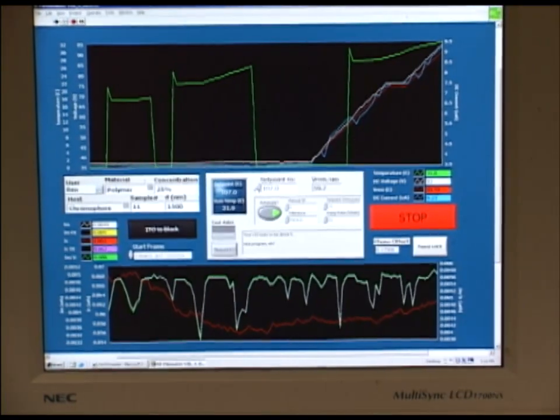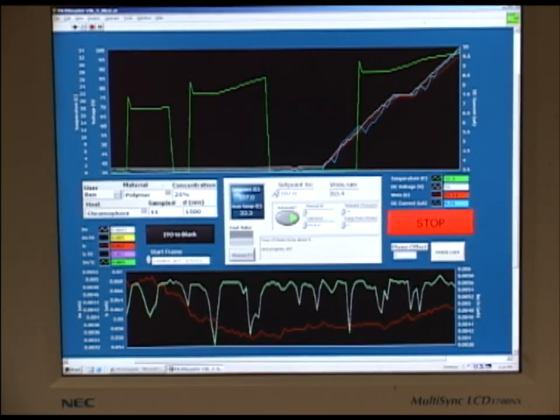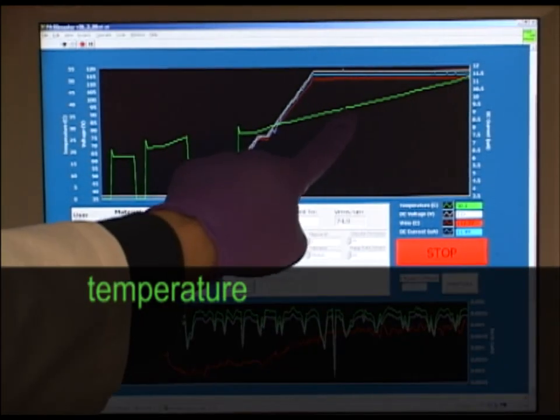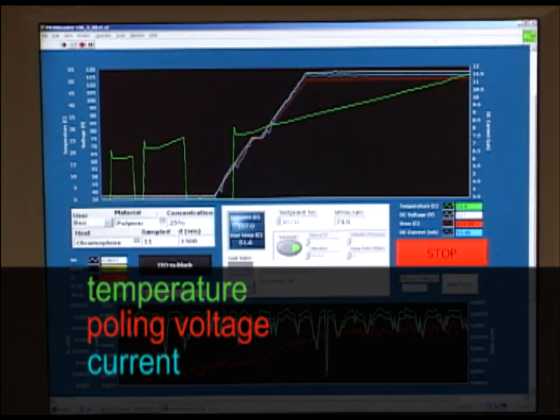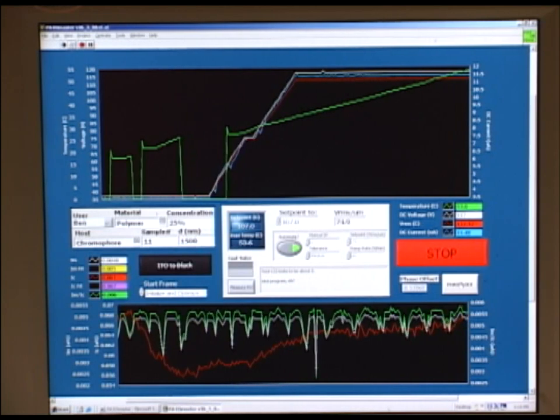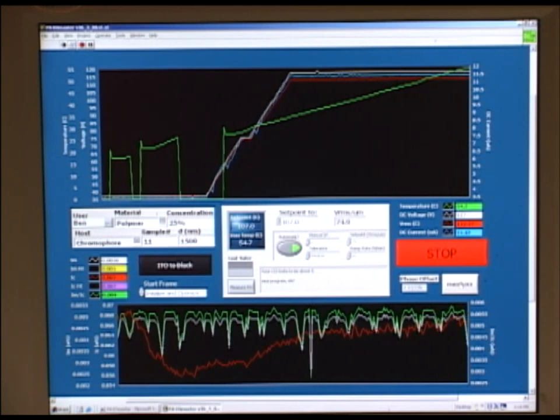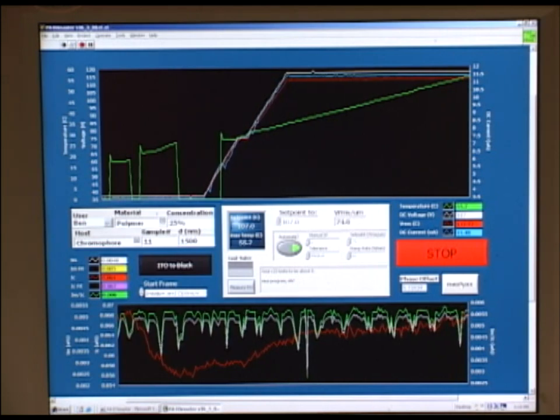Once the desired set point voltage and temperature are set the program will begin ramping up the voltage and the temperature to induce poling. On this upper graph shown is the temperature as a green line and the poling voltage shown as a red line. The blue line just above the red line is the current that is being passed across the sample. The lower graph is the optical data being received from the photodiode. At low temperatures the signal off the sample is low so this graph will look mostly as noise. As the temperature increases, signal from the sample will increase and trends in the optical data will become more clear.